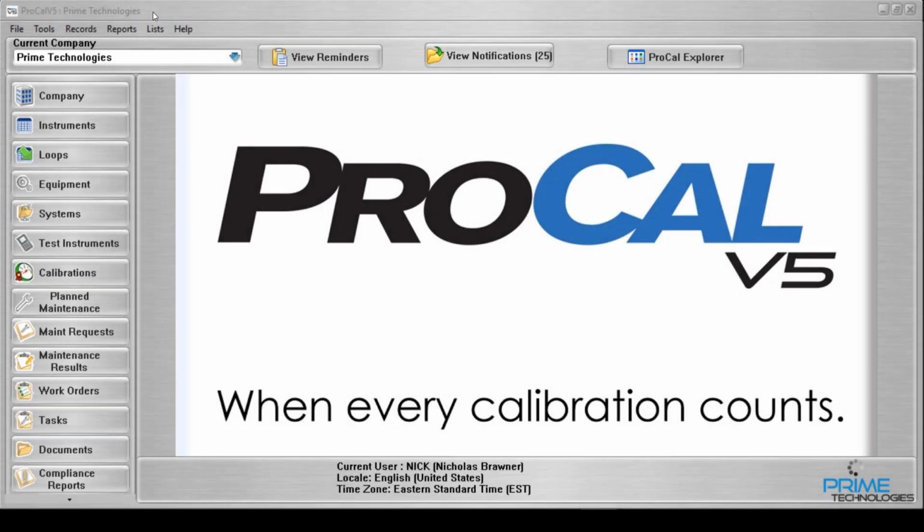The ProCalV5 import-export utility and mobile workstation are add-ons which must be purchased separately from the main software package. It brings the additional functionality of allowing the user to utilize mobile workstations with their current ProCalV5 installation. With this utility, you can move data between your production or main database and a mobile or off-site database. This is facilitated by exporting selected subsets of data from the production database to the mobile database, performing your work in the field, and then importing that work back into the production database.